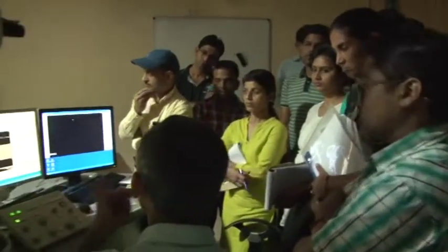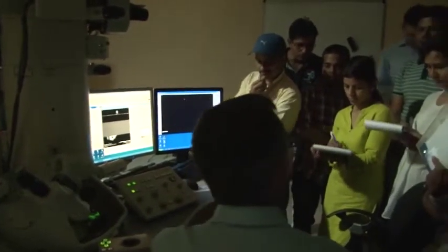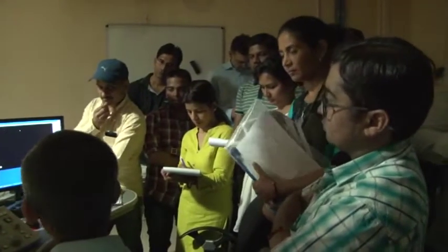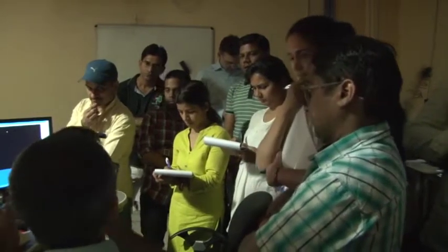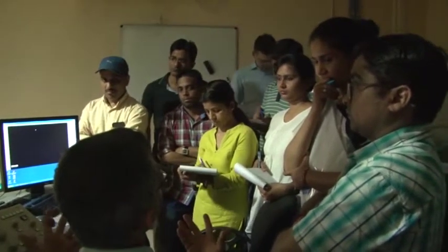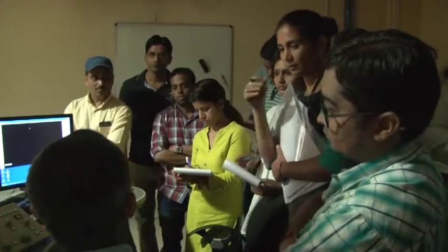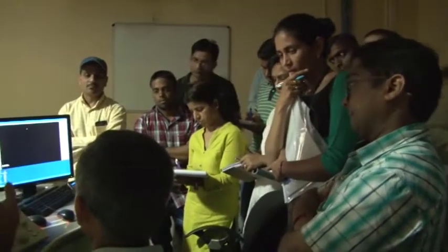Okay, so that step we have done, and so we have done the 3 steps which needed to be done at low magnification, and now we go to the 4th step, which is centering of the objective lens, and that we do by so-called high tension centering or high voltage centering. So there is no automated alignment for a particular voltage level? Because I heard it might be that there are different voltages.